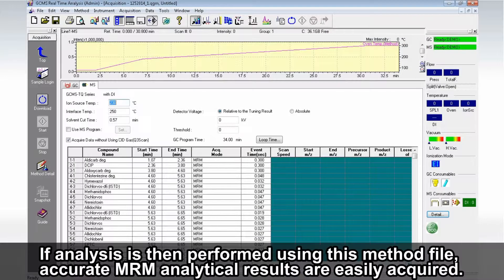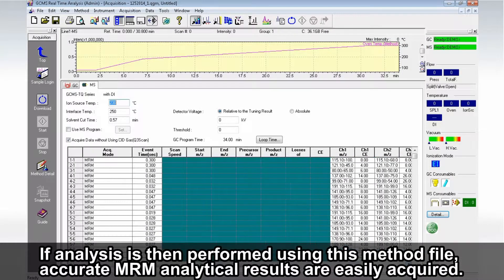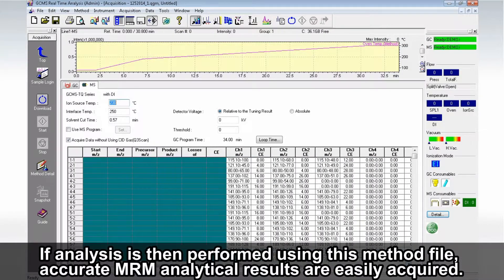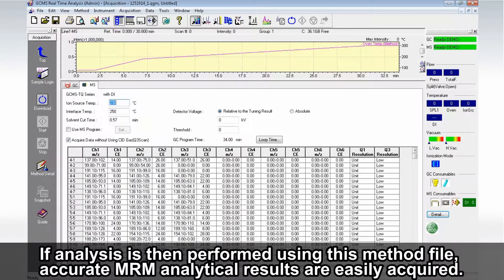If analysis is then performed using this method file, accurate MRM analytical results are easily acquired.